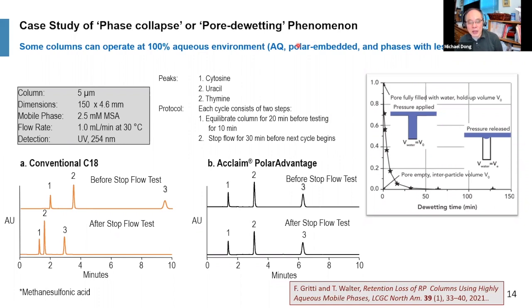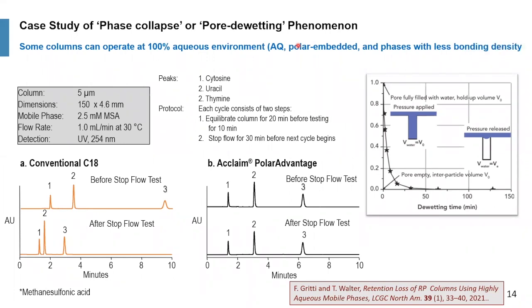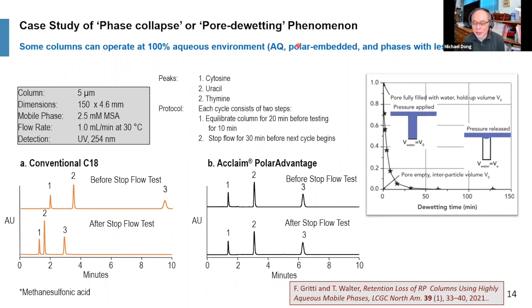Okay, so how do you do it? You keep lowering the solvent strength, right? So you go from 100% all the way down to 5%, and it is still eluting with the solvent front. So you can go down to 2%. And then, wow, you get a little bit of retention, right? It separates away from your solvent front, which is great. And then you have a method, right? A 2% methanol, 5% methanol, whatever it is, or 10% methanol, a very low solvent strength.